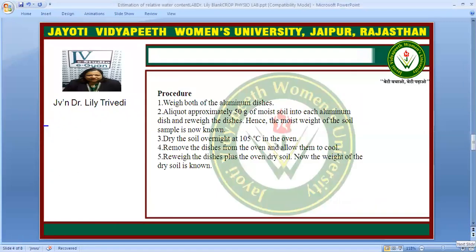Now, the procedure: we weigh two aluminium dishes and an aliquot of approximately 50 grams of moist soil in each aluminium dish is taken, then we re-weigh the soil to know the weight of the moist soil. Next, we dry the soil overnight at 105 degrees centigrade in the oven. In the morning we remove the dishes from the oven, allow them to cool, and re-weigh the dishes with the oven-dry soil to calculate the weight of the dry soil.